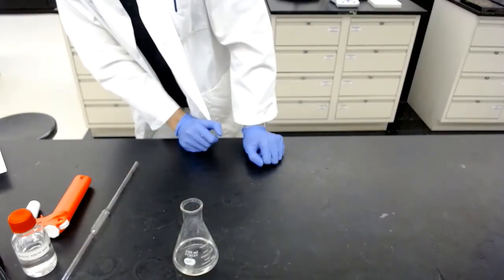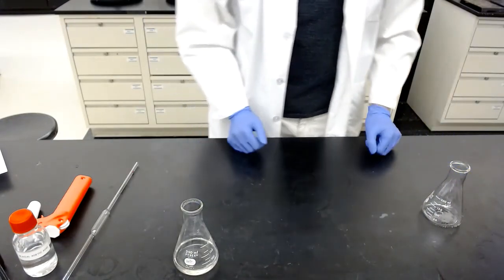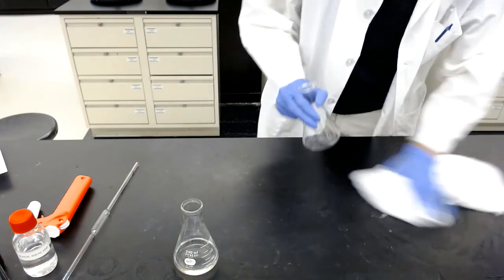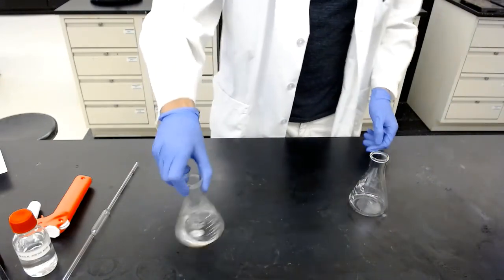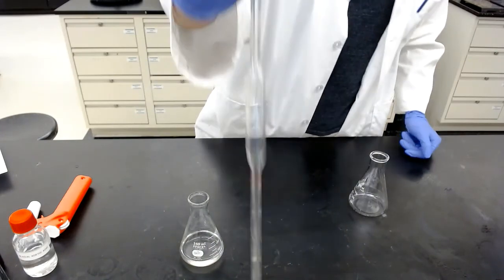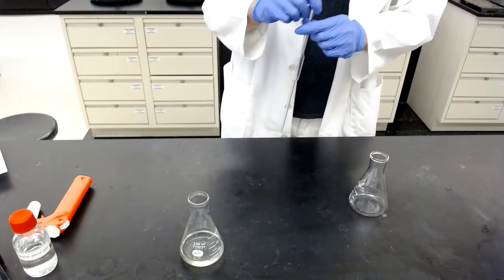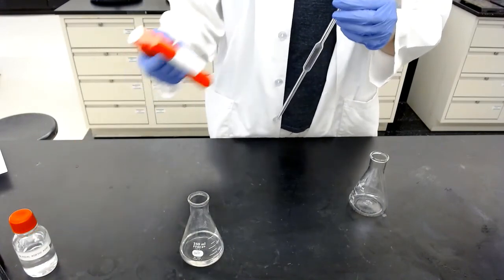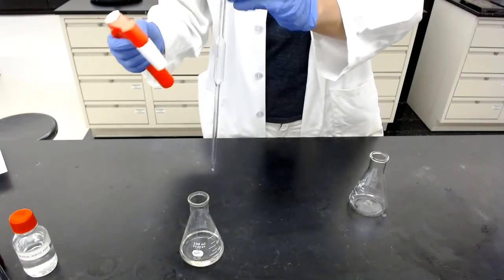Step number 2 is to start with the stock solution and take 10 ml out. We're using a 10 ml pipette to obtain exactly 10 ml of stock solution. I'm also using this particular pipette filler, right here, to take the solution out.